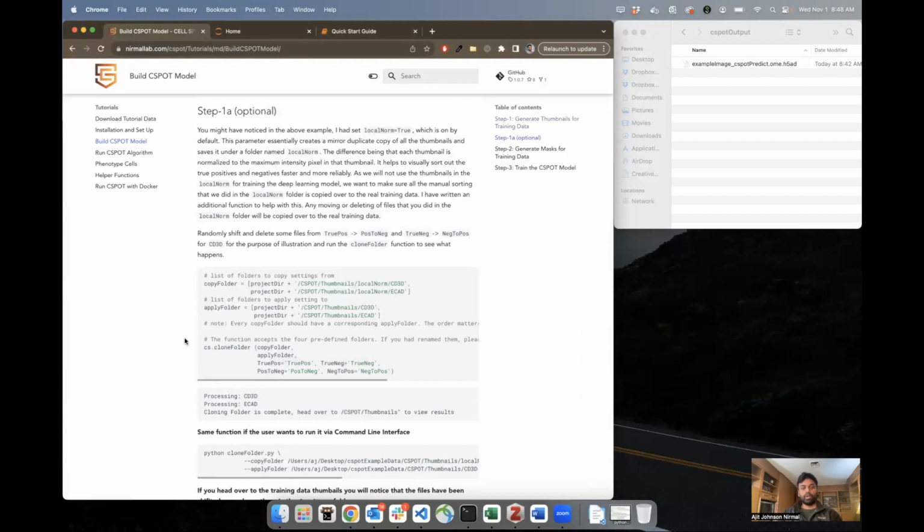I hope to also upload a more detailed tutorial video going through the process of looking through those thumbnails and how I sort them out into positive thumbnails and negative thumbnails. I just open two different folders here, one with positive and the other with negative, and I drag examples from the positive to the negative folder and delete any ambiguous examples there. So that's how I do it.